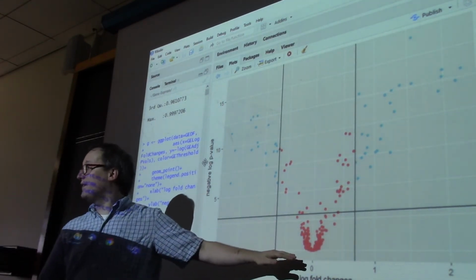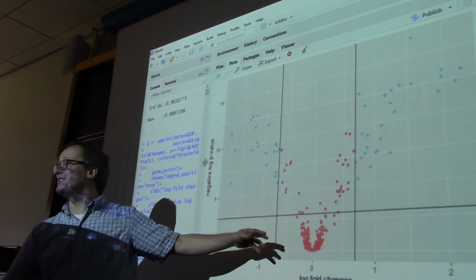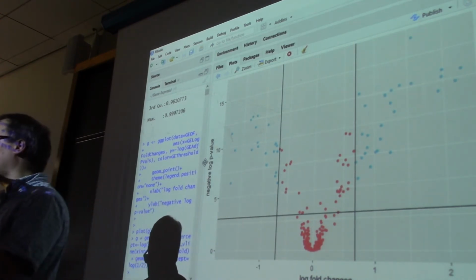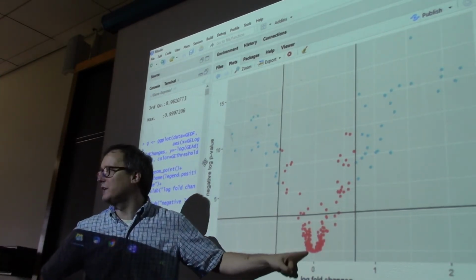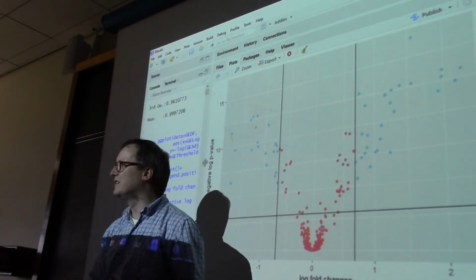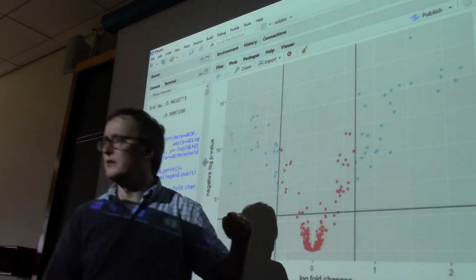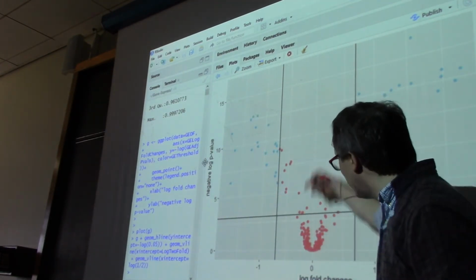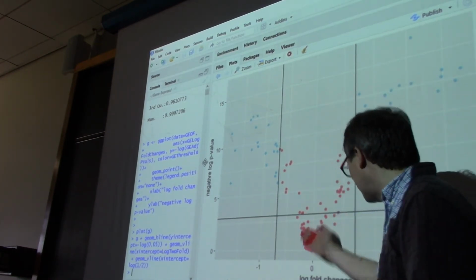Great, okay. So, having started with base graphics, we got a competent image, one that you could very comfortably publish in a journal. But here we have something that's pretty, that uses color, and that gives us a little more ability to extend upon this image. What if, for example, we wanted to differentiate this area down here where we have a whole bunch of overlapping symbols. That's kind of a mess, right? We know that there are how many blue dots on this page? 49, right. We had 49 recovered differences, which means that there are 950 of these red dots.